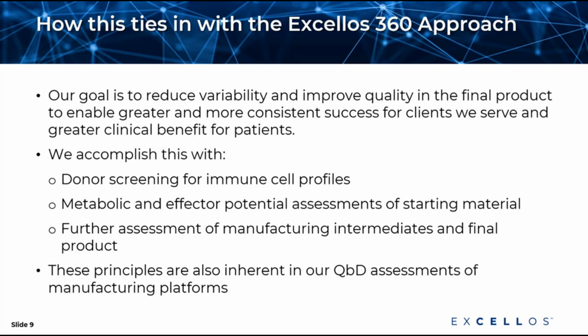And I quickly want to segue as well into some of the tools we use to assess the metabolic fitness as well as the effector function potential of the starting material. We believe that this cohort of information provides better prediction of which therapies or which drug products are going to be more efficacious to use. It also lends itself to understanding the manufacturing process, and this is all pretty much done by quality by design assessments in different manufacturing scenarios.